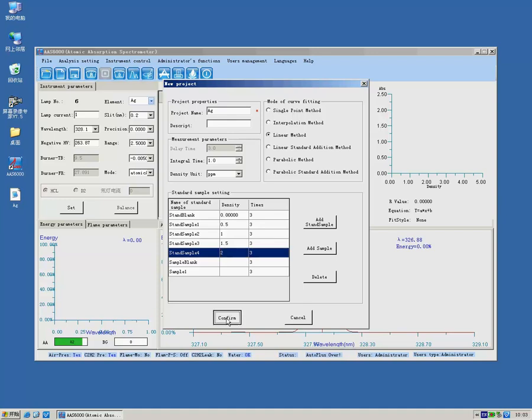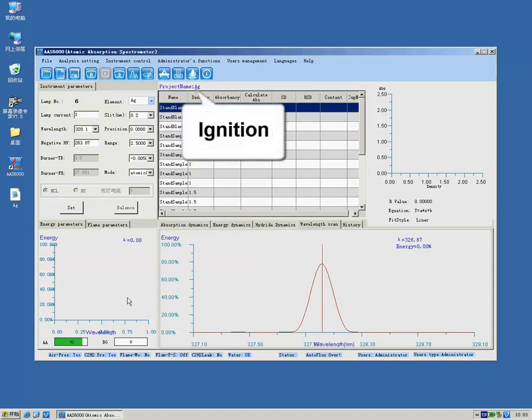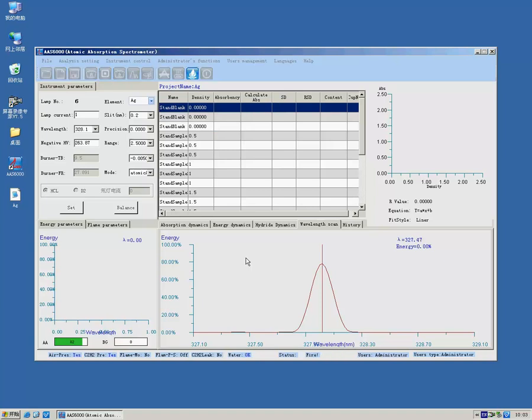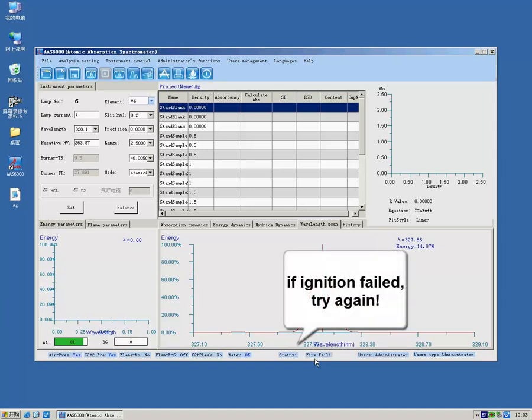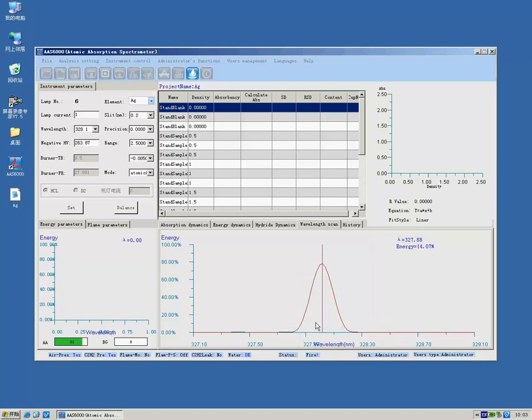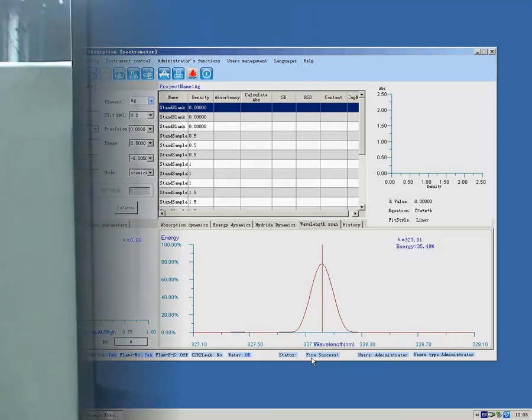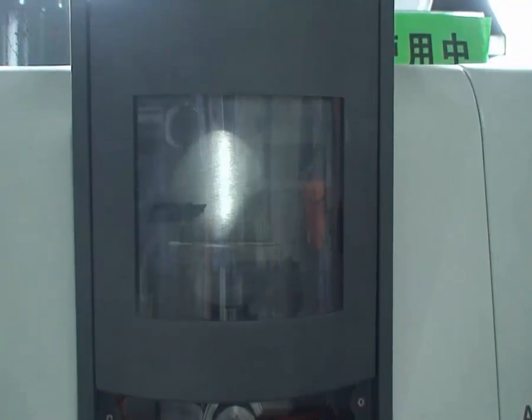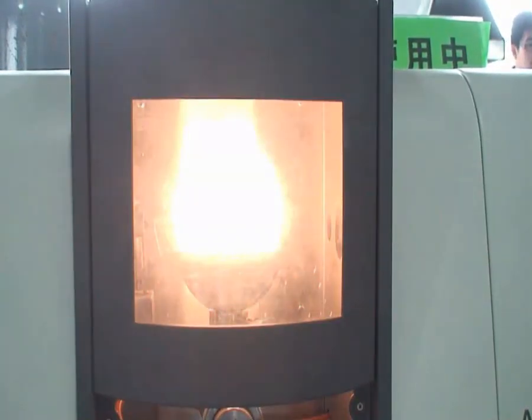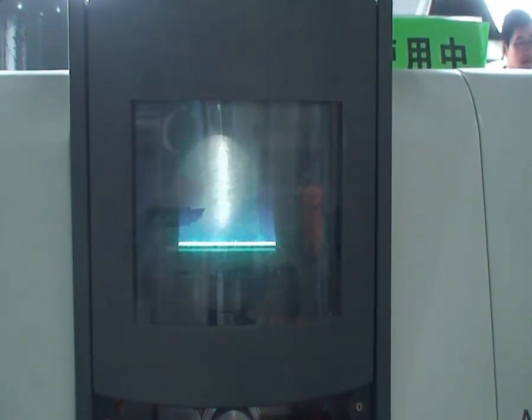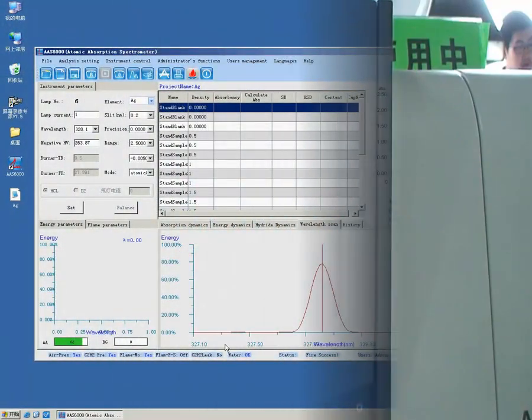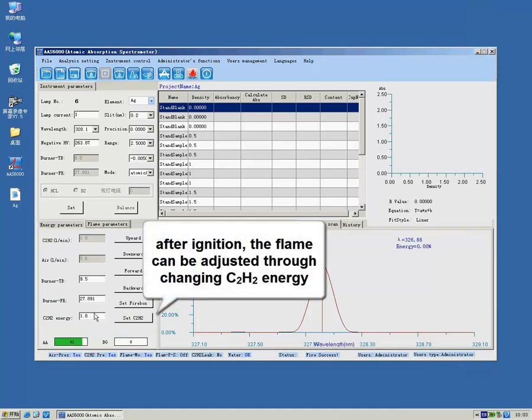Ignition. If ignition fails, click again. If ignition succeeds, the blank can be watched in the position of the atomizer. Now we can see the flame.